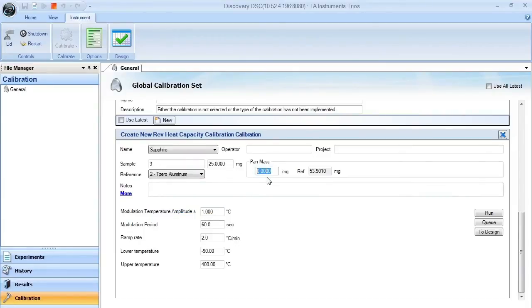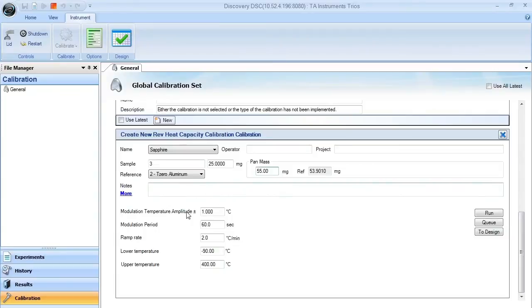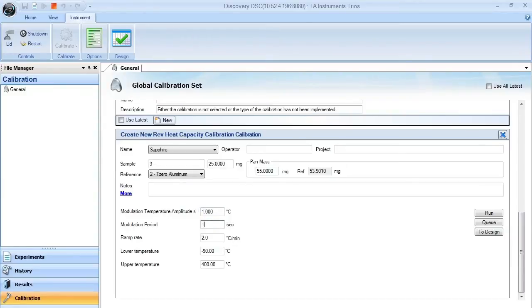You can enter in your sample pan mass. You also need to select the appropriate modulating conditions for this experiment. In this case, we're going to modulate an amplitude of plus or minus one degree every hundred seconds with a ramp rate of about two degrees C per minute.